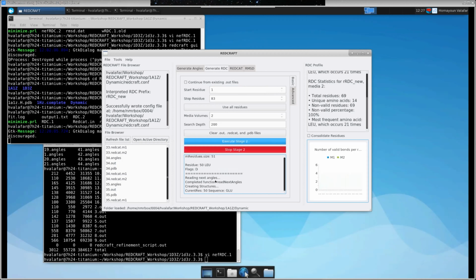So with Redcraft's approach, therefore, there is no business of this cluster of structures within a window of so many angstrom variation, where like we do with NOE-only structure calculations. So it looks like all your PDB files, you just showed just the final structure. Right, and the recognition there is that you never have just a single PDB. You always have a structure such that the alteration of that structure still fits your data.